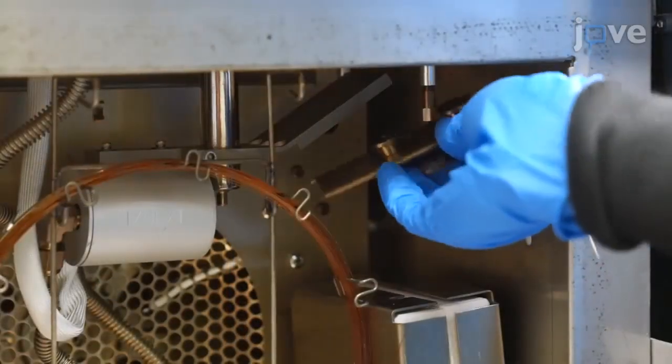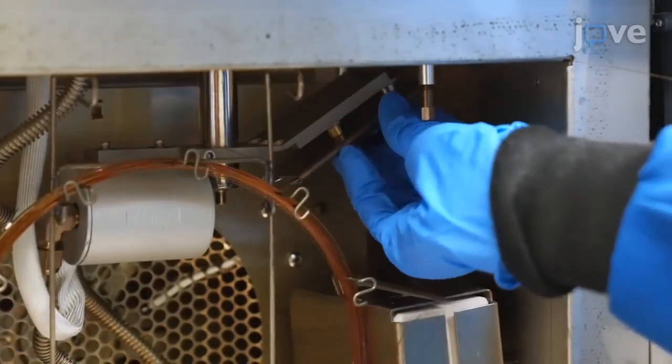Place the column holder into the modulator and adjust the loops.